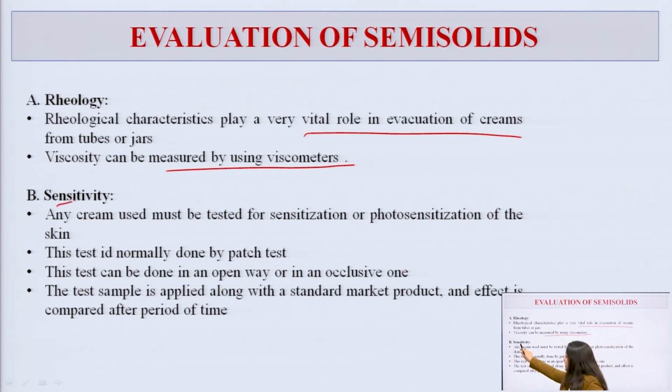Another test, as I have said, is the sensitivity test. It helps us to analyze whether our product is sensitive or not, whether it is causing any irritancy, any inflammation, or any harm to the area onto which it was applied.